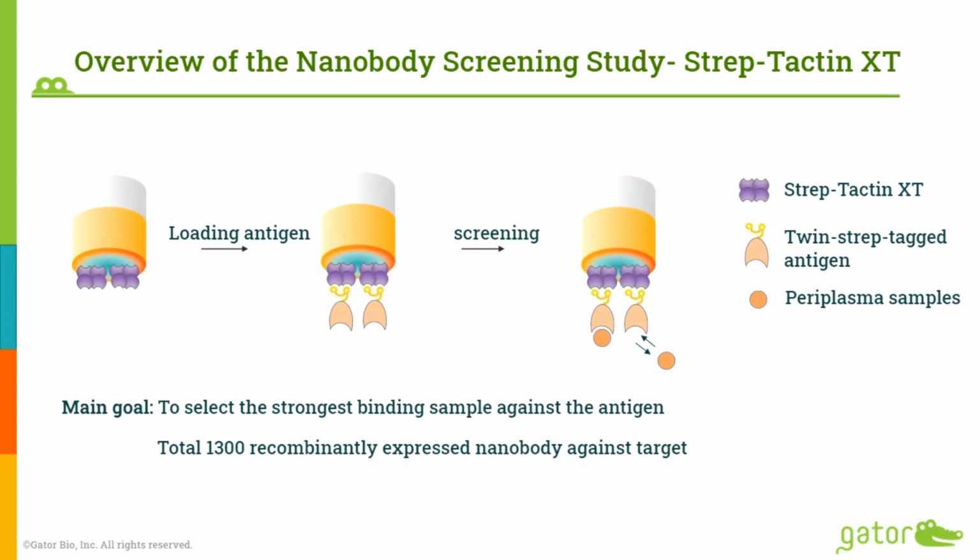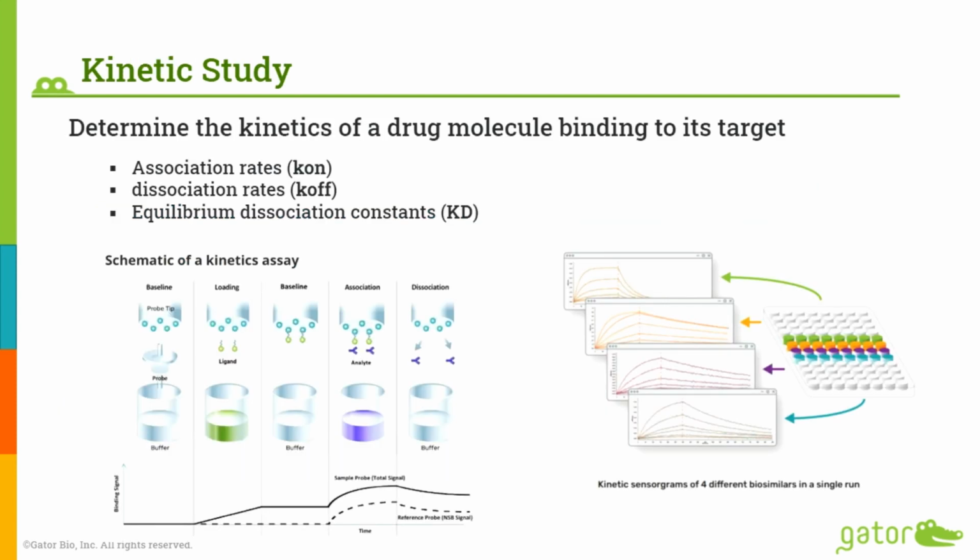Now, how did we set up the study? First thing is we had 2 types of study. One is we want to understand the binding event. First, of course, yes or no binding, which we want to compare with ELISA. And then the next thing is we want to take it to the next level. We want to provide Libin, our collaborator here, with more information.